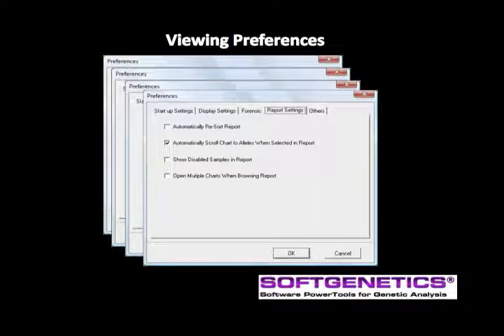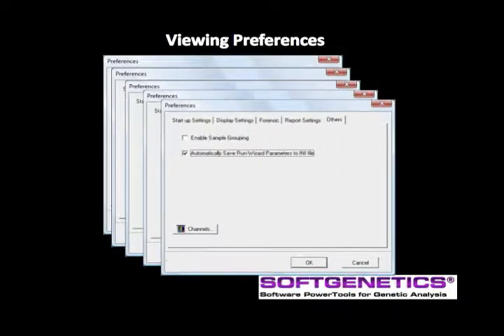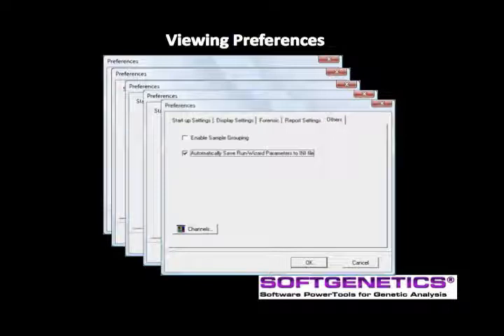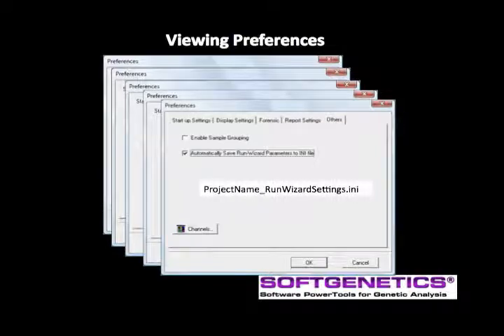The report settings tab has four options. Be sure to deselect automatically resort report if you do not want the edited files to drop to the bottom of the report table. The last tab, others, includes options to enable sample grouping and to automatically save run wizard parameters to an INI file. This automated feature enhances the audit trail by automatically saving the run parameters using the saved project name underscore run wizard settings dot INI. There is no need to name this file; the program automatically saves the INI file at the time that the analyst names and saves the project.